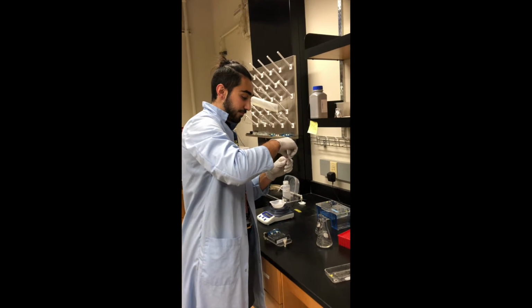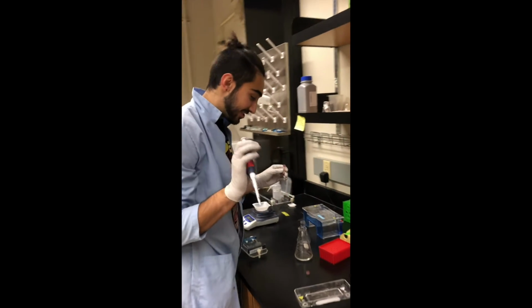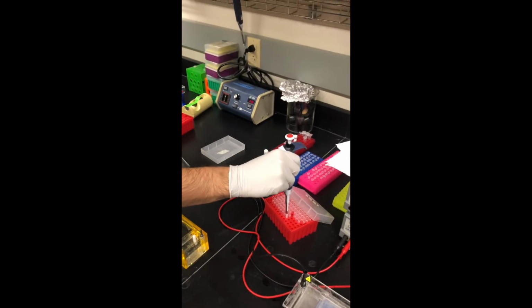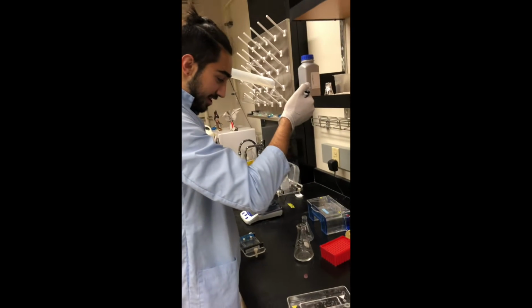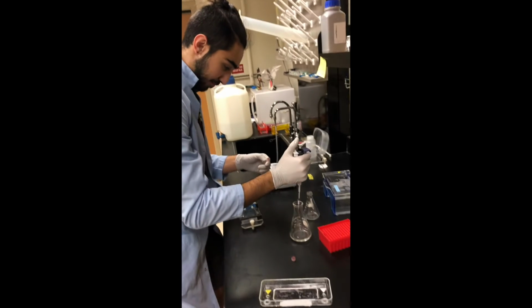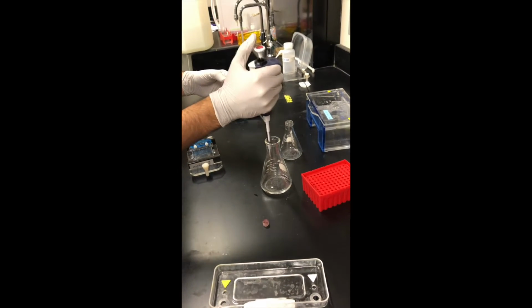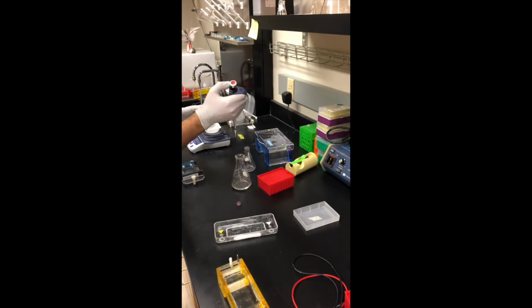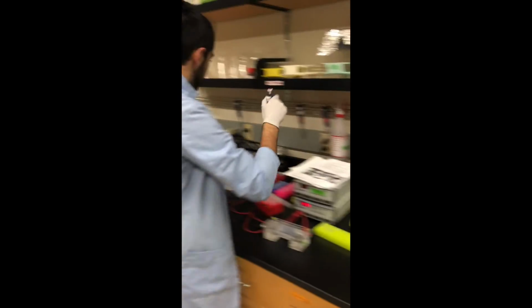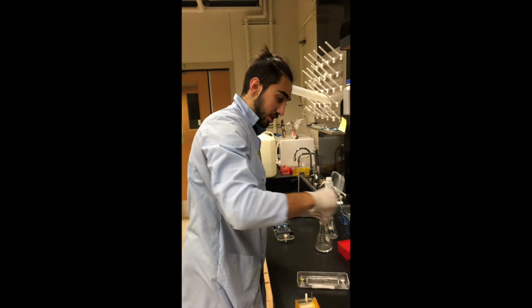So what we're going to do, we're going to take 1 microliter of it, and this pipette is already set to 1, which is fantastic. We'll get our little tip. Alrighty. And we have to be very careful. And deposit our cancer juice in there. I want to put this in the trash. Put that away. Put everything neatly away so we're orderly and in check.